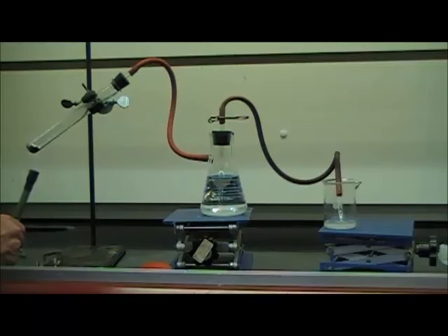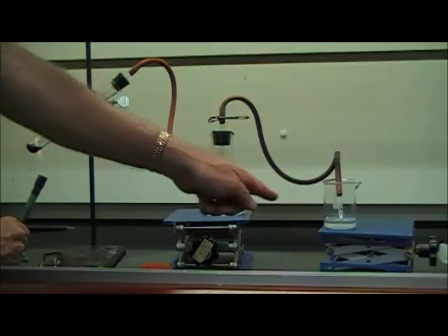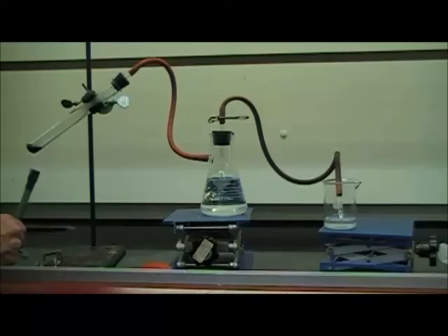Pretty soon it's going to start happening very fast. You'll notice the level in here will start to go down pretty quickly. When that happens, you want to take the heat away because you don't want the level in that flask to go below the bottom of that tube. I don't know if you can see in there, but stuff's beginning to happen in the test tube. We're getting quite a bit of water now in the beaker, and this level in here is decreasing somewhat.